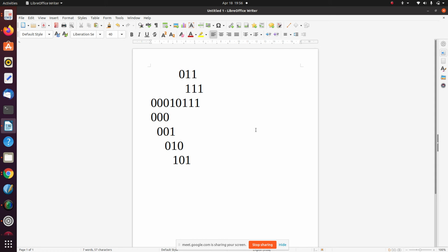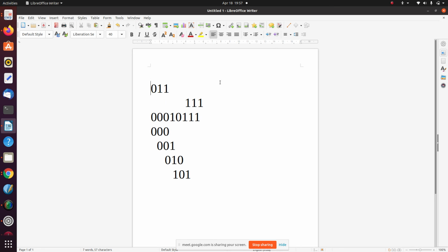One zero, right? Yes. How many reads cover? 1, 2, 3, 4, 5, 6. Six. How many reads more are left? Two. What are the two missing reads? 101, right? 101 is there. 011 is also there.